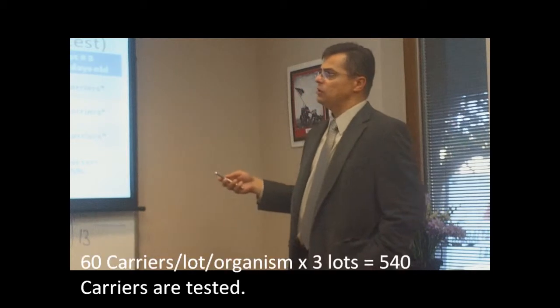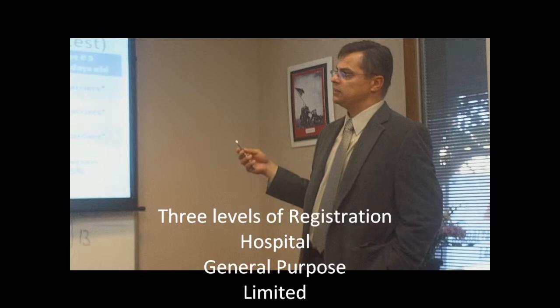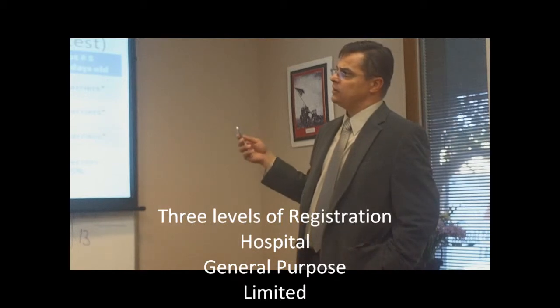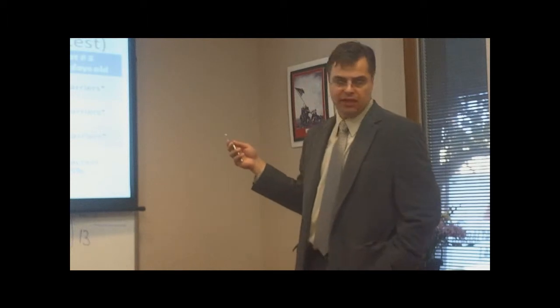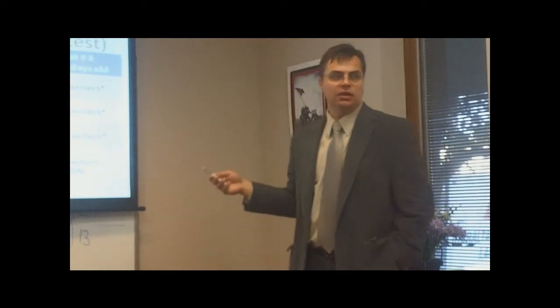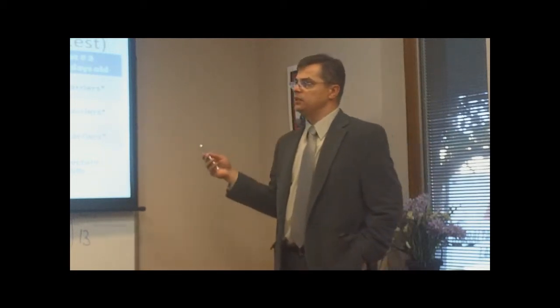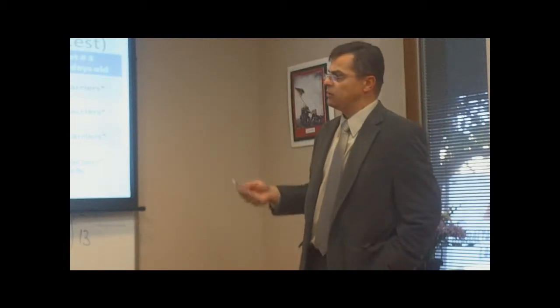You can also do a disinfectant that is going to be used only as a limited efficacy study or used in household disinfection. So then you can do only Staphylococcus and Salmonella, or you can do either one if you want to claim a limited disinfectant for use only in a specific environment.